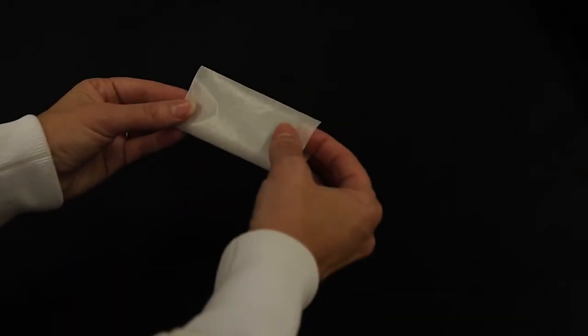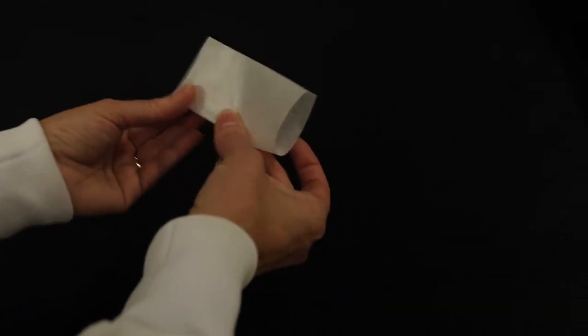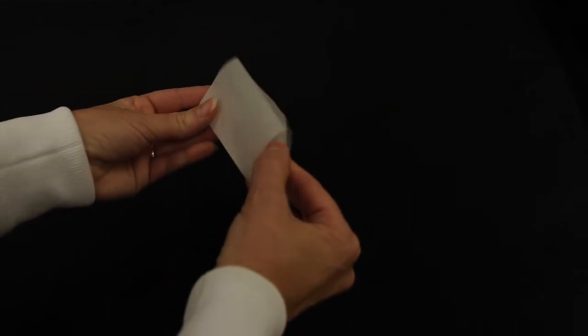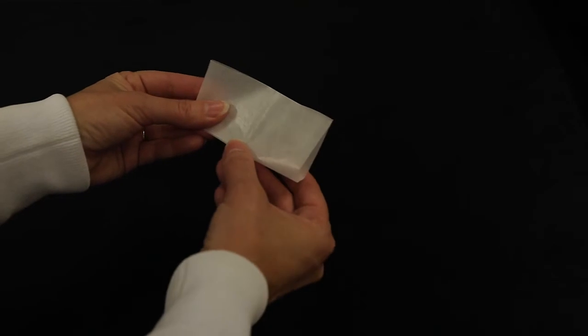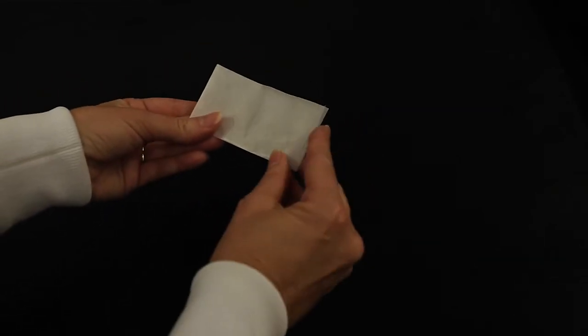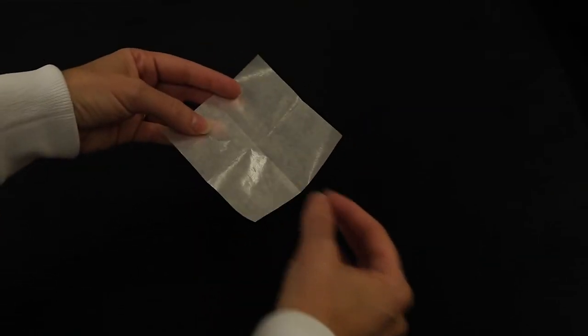Fold the weighing paper perpendicular on both sides to form a cross in the middle. This creasing will help hold the chemical on the weighing paper.